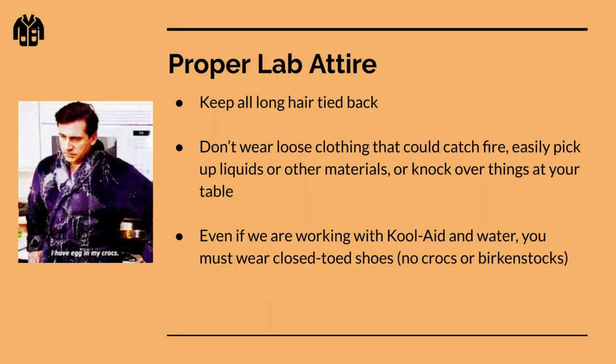Okay. Proper lab attire. Obviously, ladies and any guys with long hair, keep all hair tied back. We need to keep our hair out of things. We need to have proper attire. Don't wear loose clothing. That's obvious. We don't want to get any nasty liquids on it. We don't want to get any fire caught on it. And even if we're working with Kool-Aid and water, you must wear closed-toed shoes.